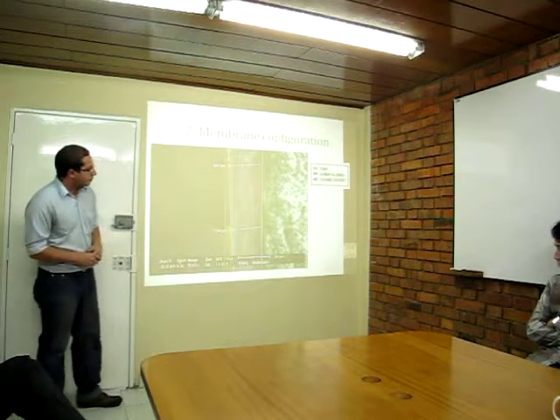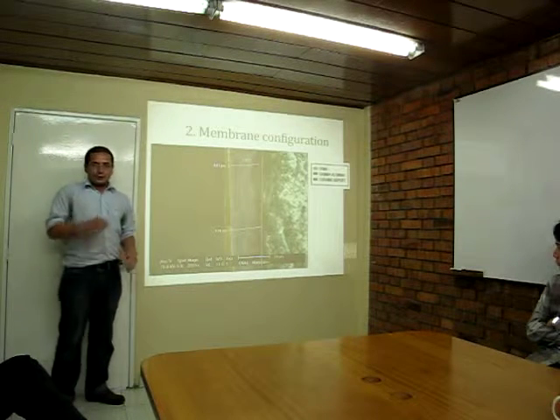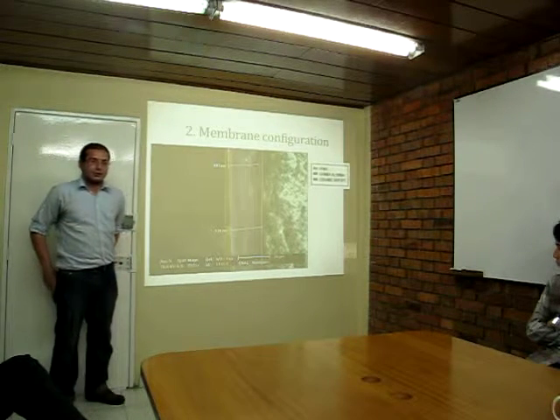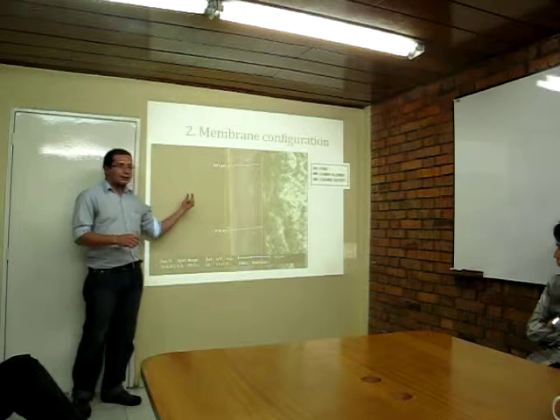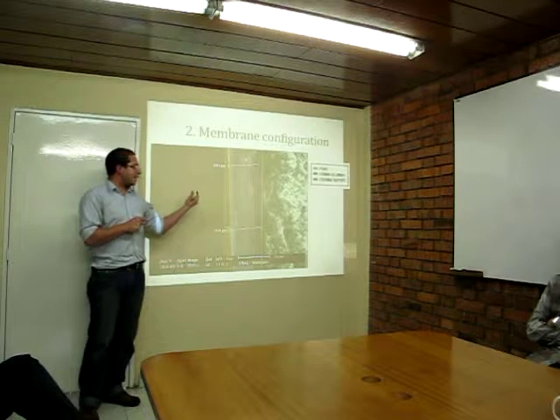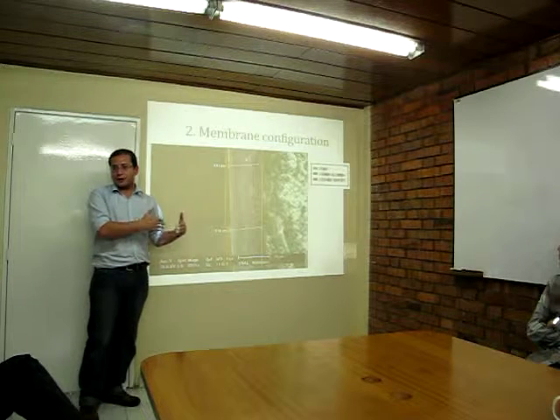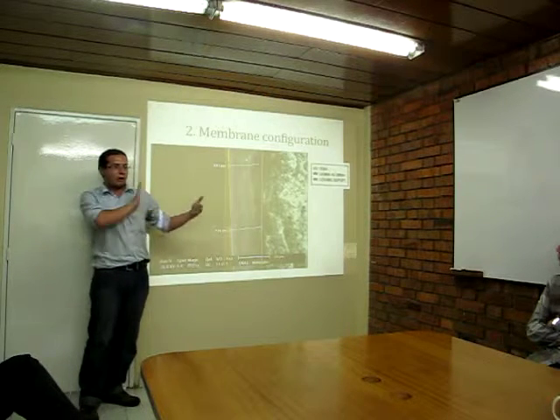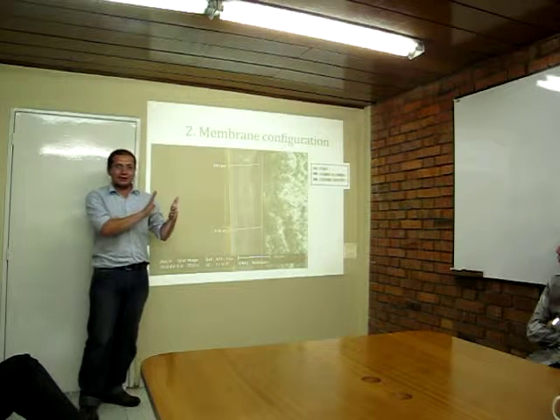What is the role of the gamma alumina? It's a good question. This membrane has a particularity: when it has contact with the blend of ethanol and water, it swells. It expands.